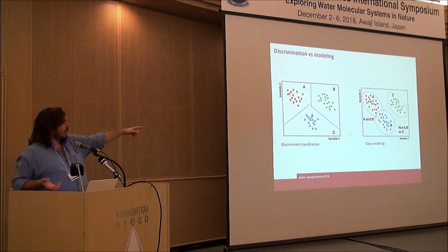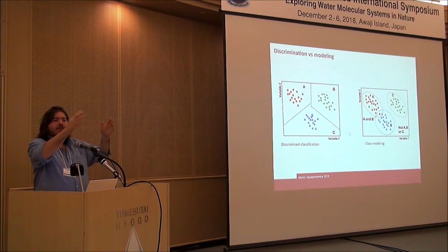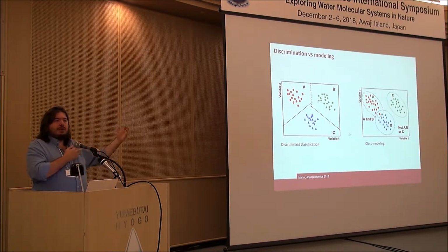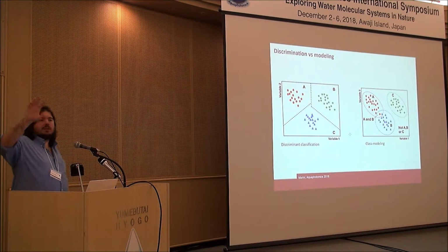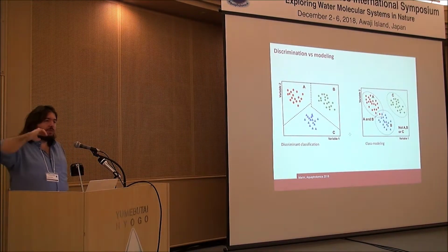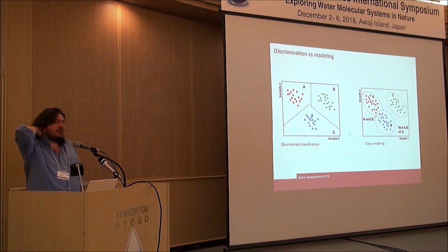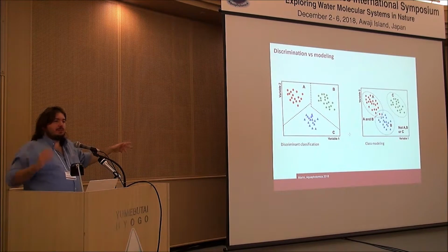For instance, if the second class be class B, then I would have a class boundary that would be partly overlapping with the model of class A. But if it be class C, then I would have a completely isolated class space on another set of the plot. And what's the advantage of such an approach is that whenever I have a new sample, it will fall on some part of the space.